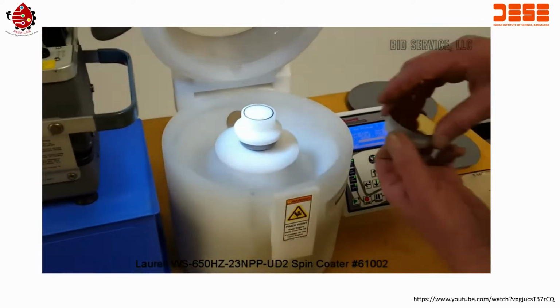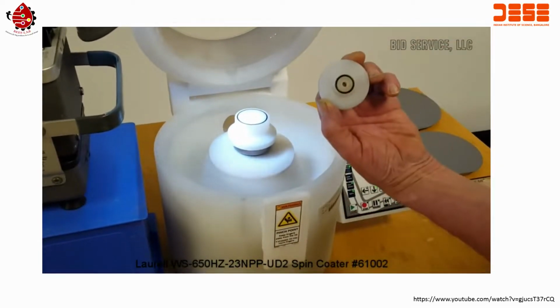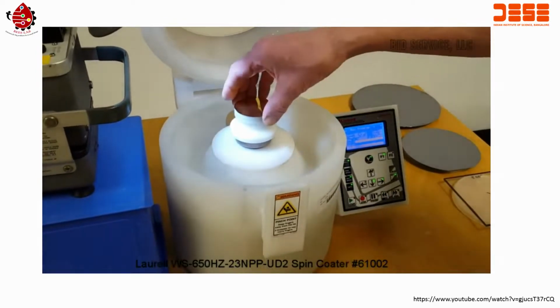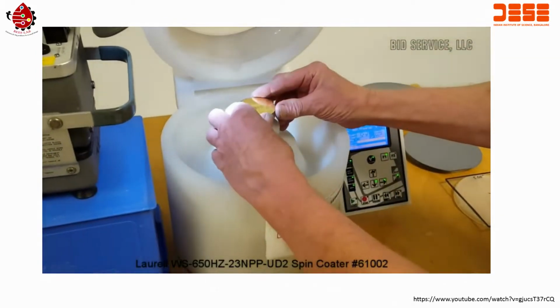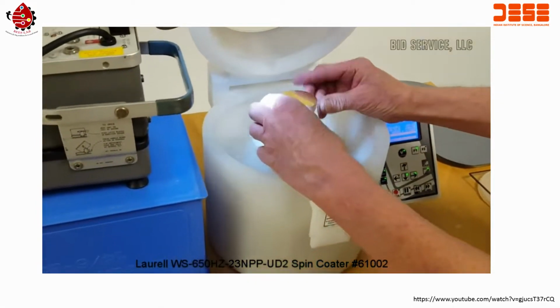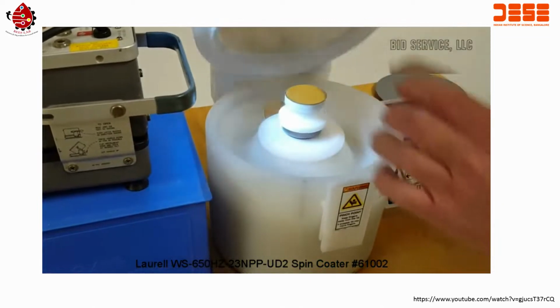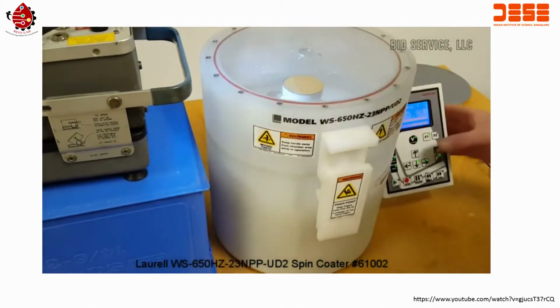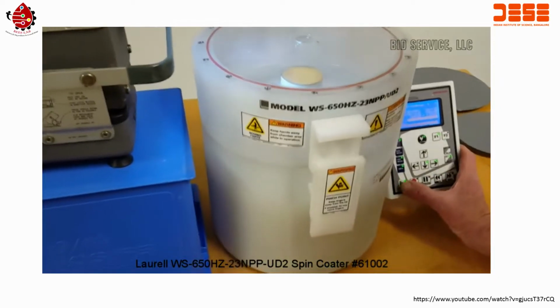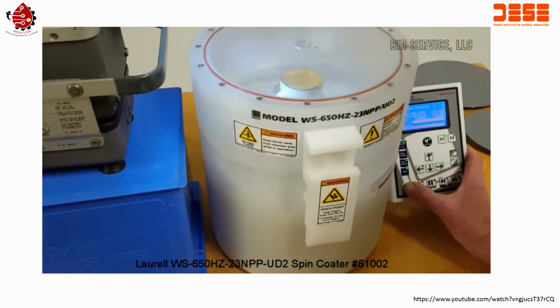Next, we're going to spin a small wafer. It has this very, very nice little adapter here that you can fit right on top of the standard chuck. First, we apply vacuum, and we'll spin this little wafer at the maximum speed.